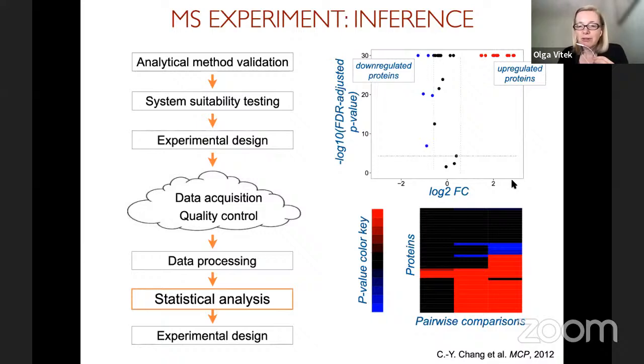However, log fold change alone is not a good criterion on whether this change that we observe is more systematic than what we expect to see by random chance. We need to compare this fold change to the extent of the underlying biological and technological variation, and p-values allow us to summarize that. Here, p-values are adjusted for multiple testing. I will talk about this in a minute. Traditionally, we take the negative log transform of this adjusted p-value so that high values mean more statistical significance. So we are interested in the upper left and upper right corner of this comparison plot. Vertical lines delineate the fold change cutoff. It's fine to apply it as long as we apply the statistical significance cutoff corresponding to the false discovery rate of whatever you chose before analyzing the data.